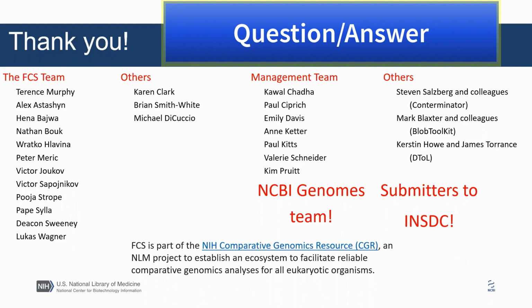Yeah, I'm interested in that as well, and I haven't given that much critical thought, so maybe something interesting to look at. But does it ever happen that there is contamination that arises from some kind of electronic mix-up when they're trying to assemble data? Yeah, possibly. I don't know, but it's interesting that those organism sequences are in there because it seems just sort of out there.